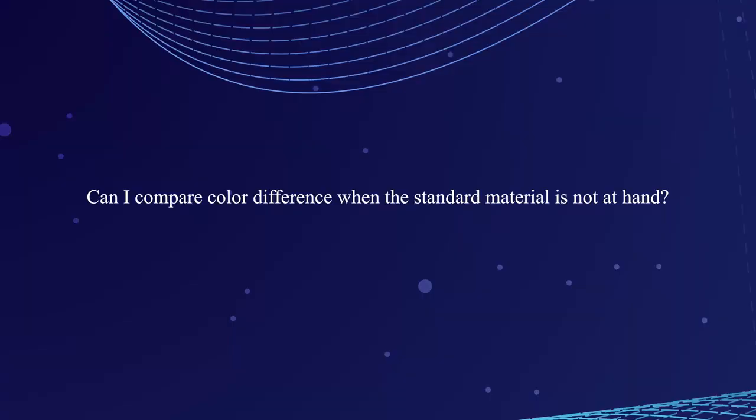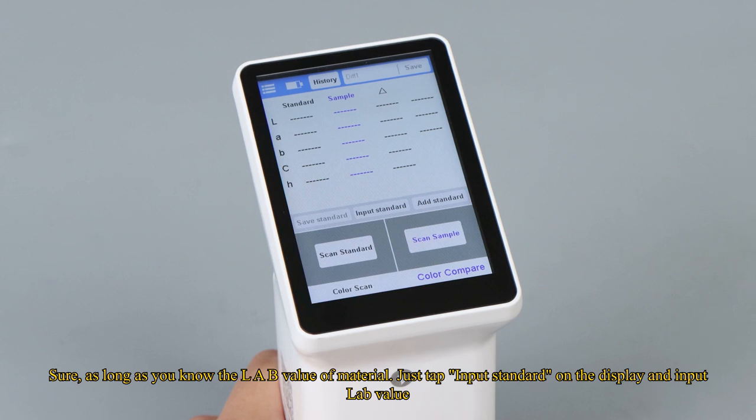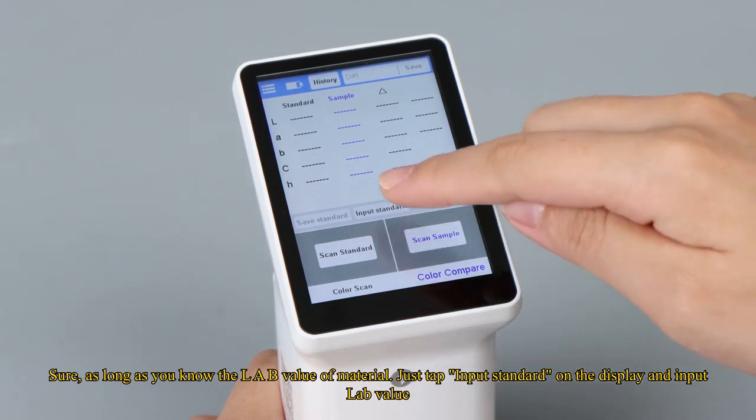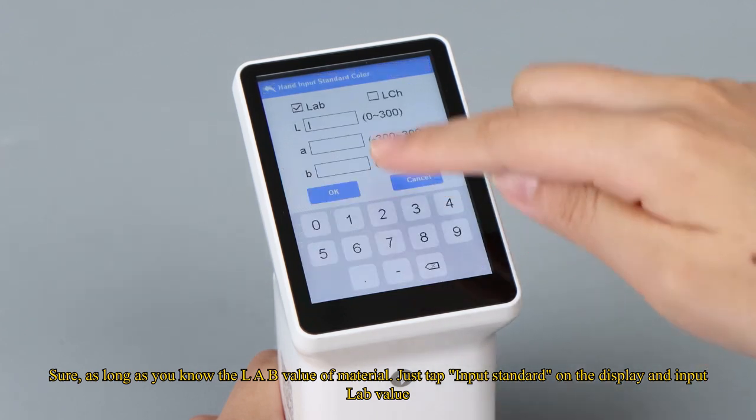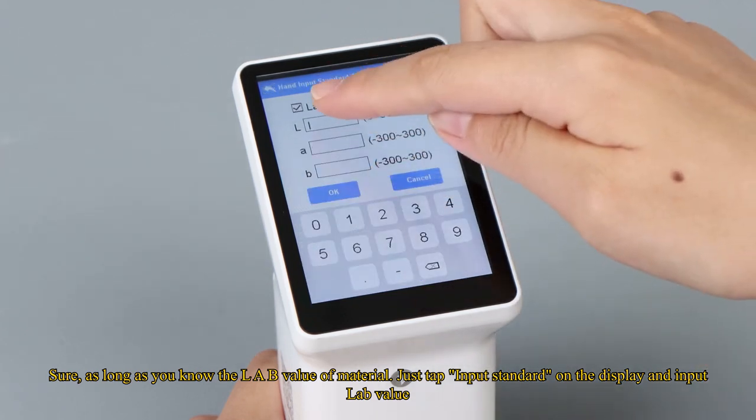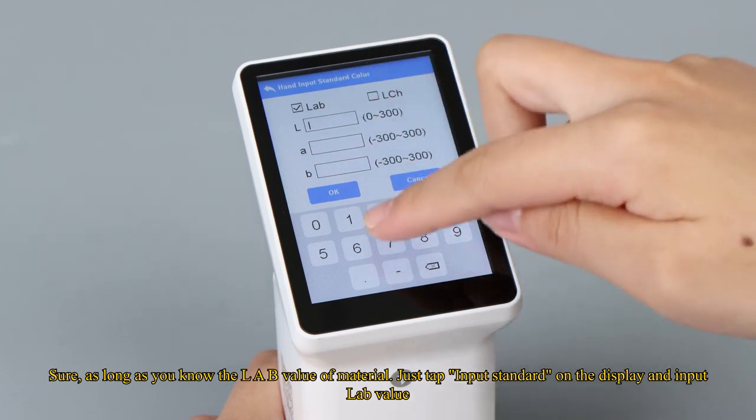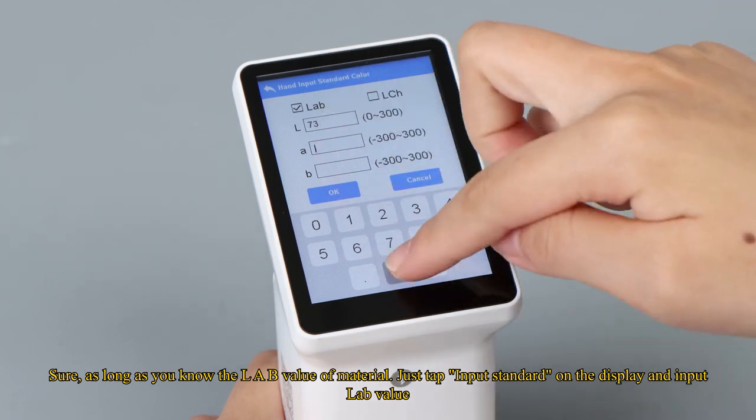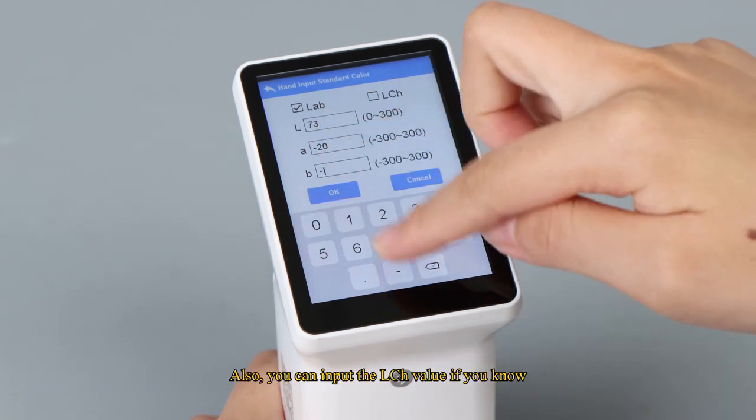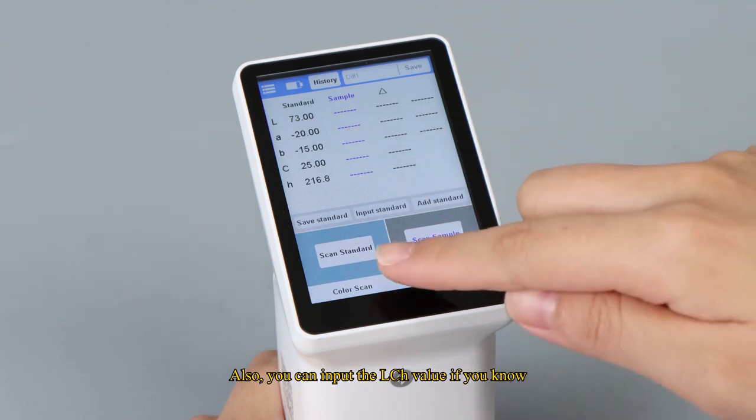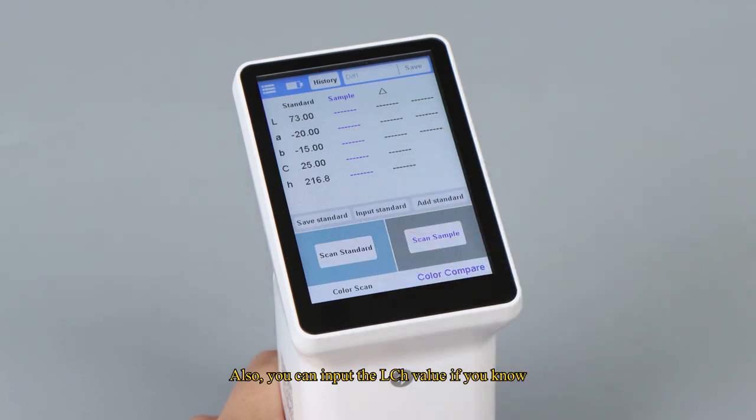Can I compare color difference when the standard material is not at hand? Sure, as long as you know the LAB value of material. Just tap input standard on the display and input LAB value. Also, you can input the L, C, H value if you know.